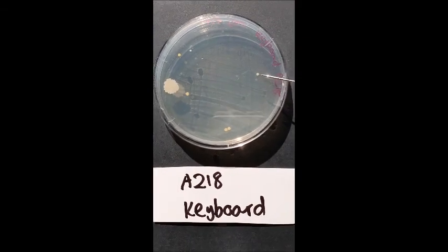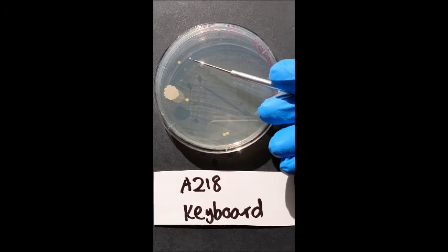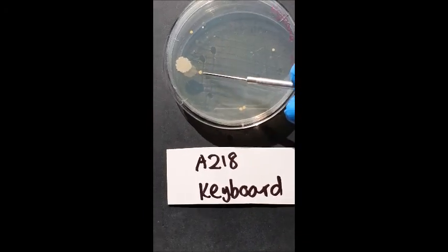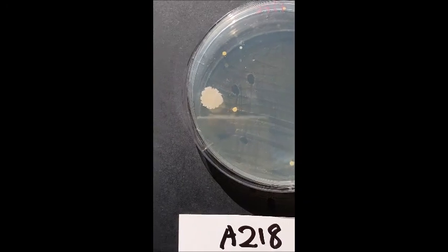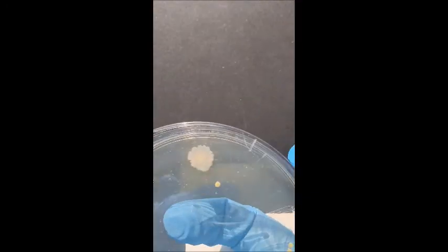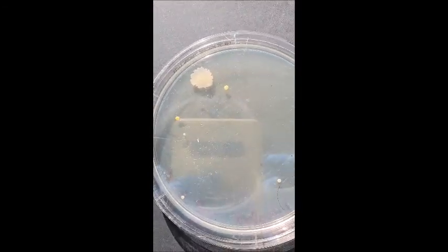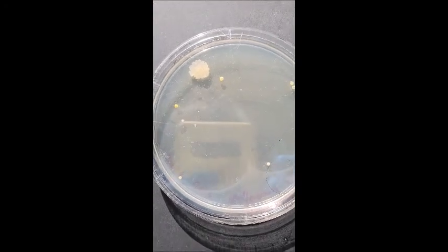See, that one is like that white one that's kind of everywhere. That was in my shoe and on the whiteboard marker. And then we've got this yellowy one, which was also on the whiteboard marker. And then this guy. Ooh. Which is completely different to the other ones. It's got a rigid outline, so that is clearly a different type.